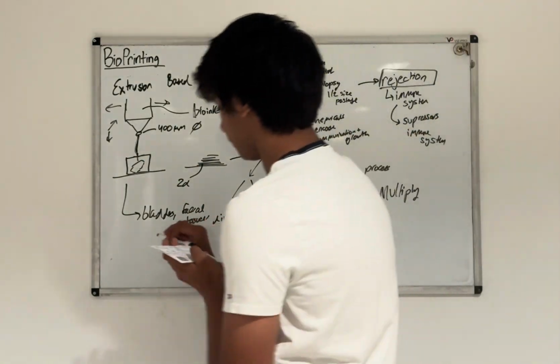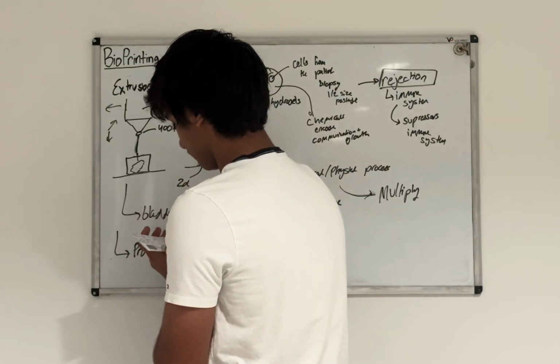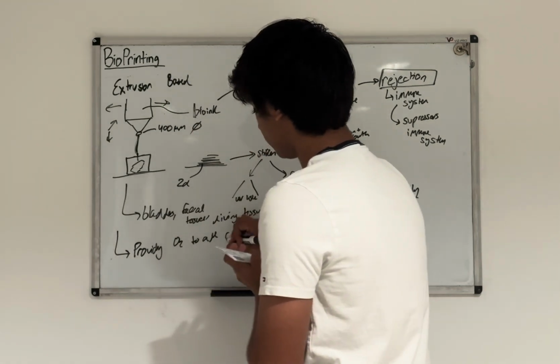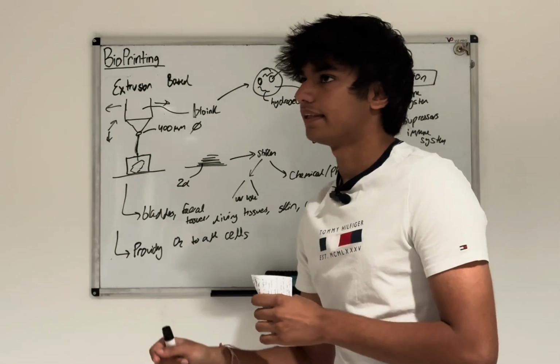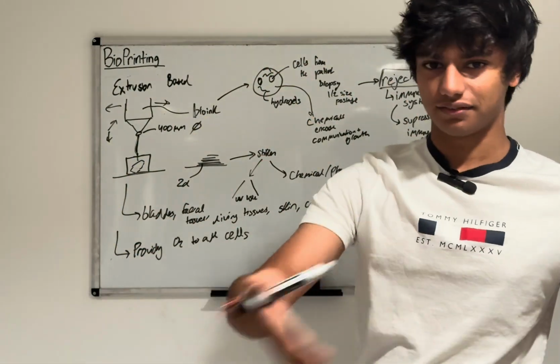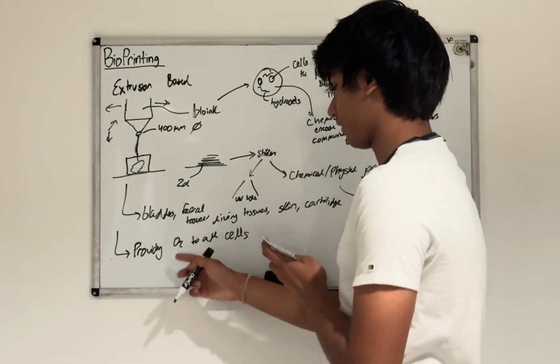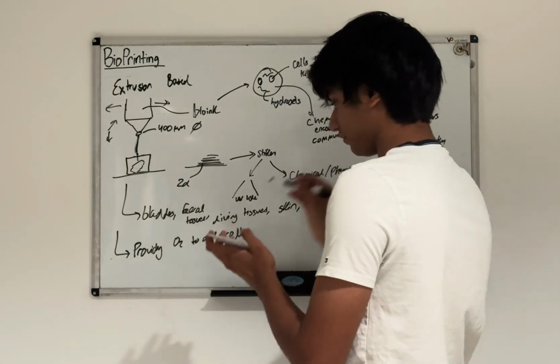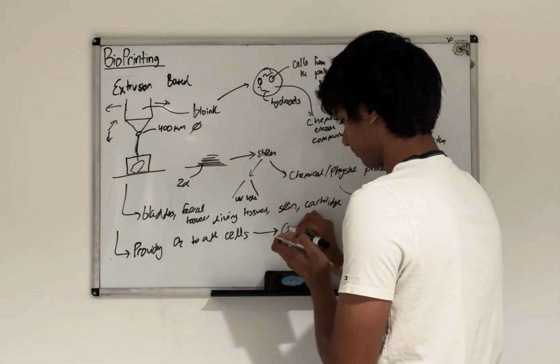Now, the challenges with bioprinting mainly involve providing oxygen to all the cells during the process, right? Because the issue is if you have your bioprinted material and you're printing it and you stack them on top of each other, they could lose oxygen. And you need oxygen for the cells to survive. So it's hard to provide oxygen to these cells when you're bioprinting. And because you're not able to provide oxygen, it's harder to create complex organs.